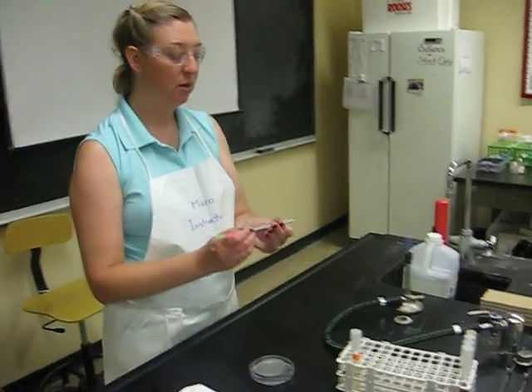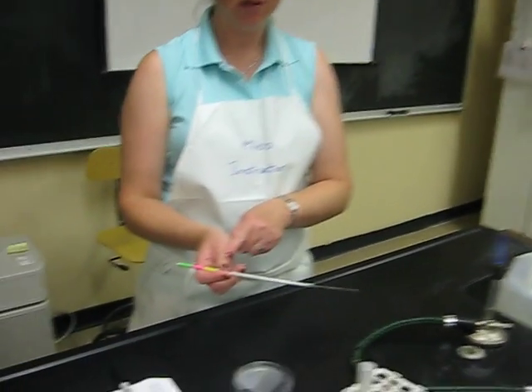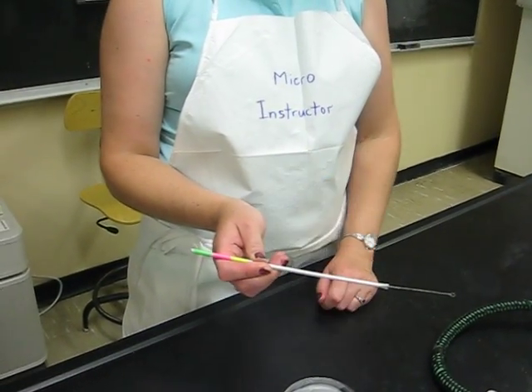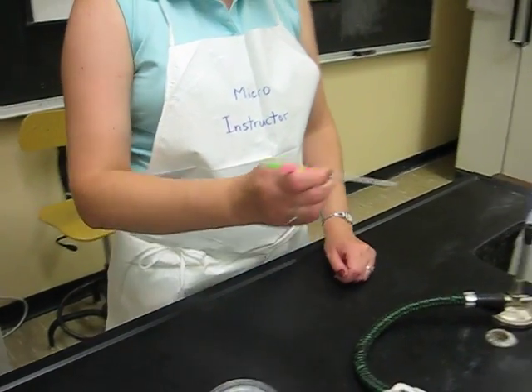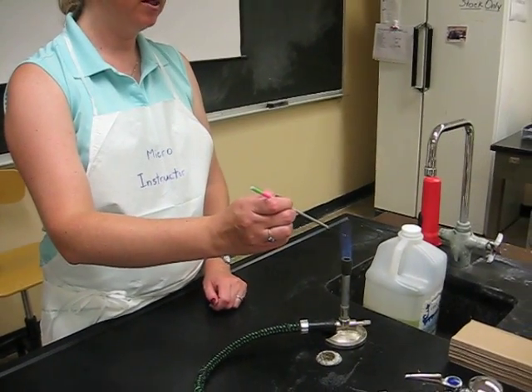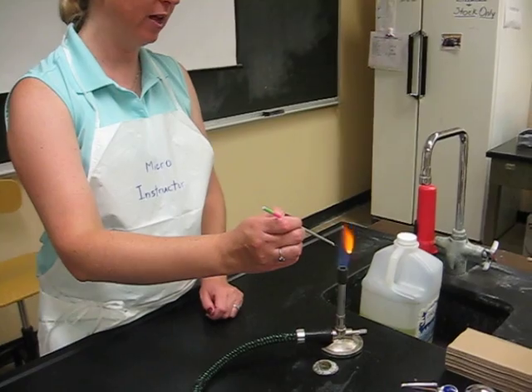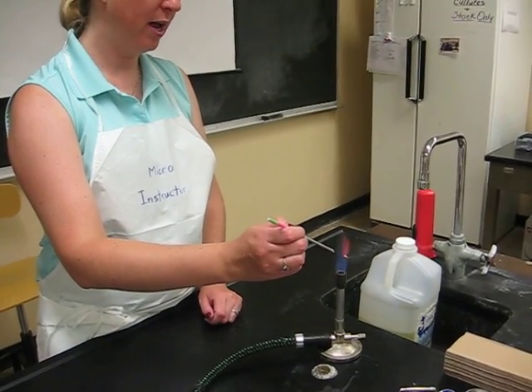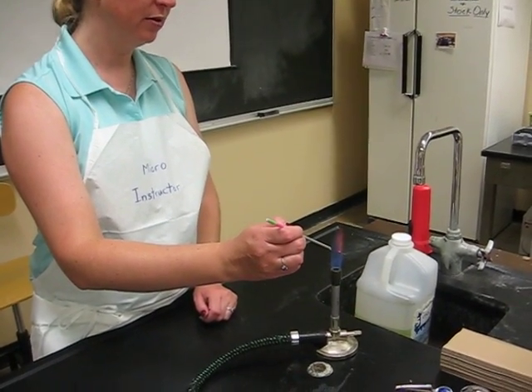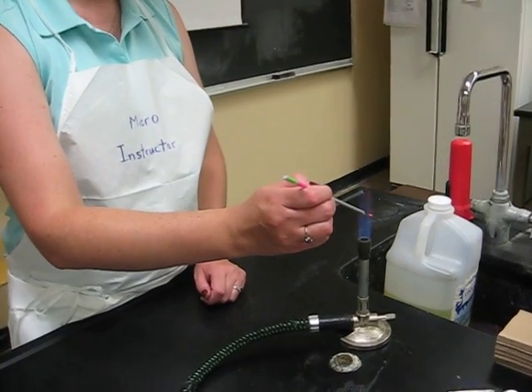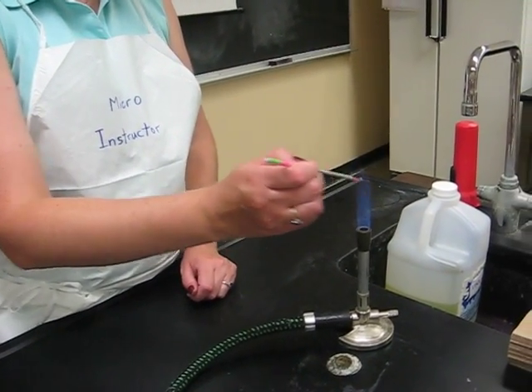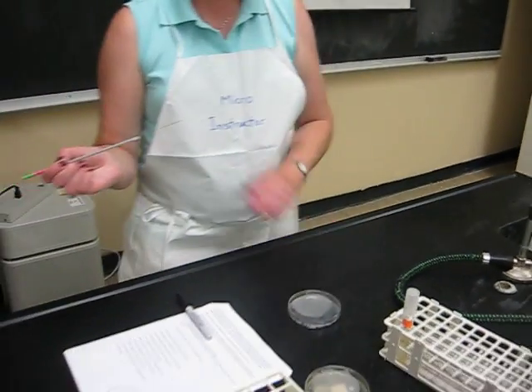Pick up my loop, hold it between thumb and index finger, and rest it on my middle finger. Flame until it's completely orange the entire loop, the hottest part of the flame, all the way to the handle. Give it a second to cool.